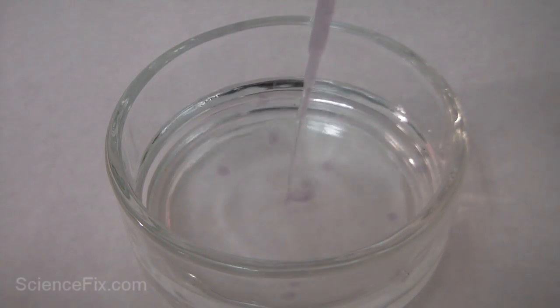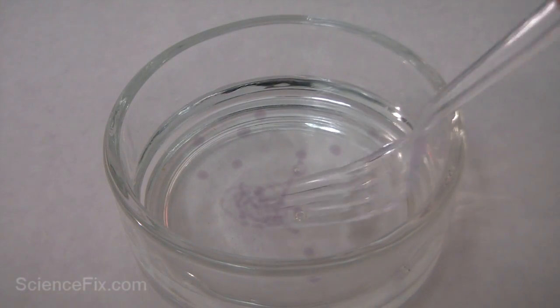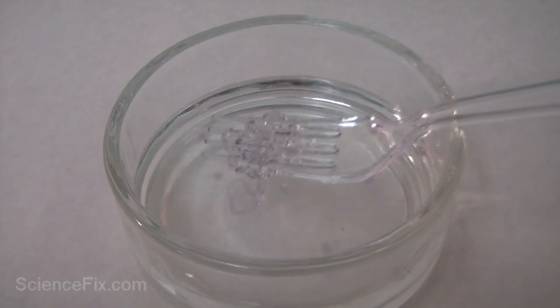Next, a larger amount of sodium alginate is squirted at once into the calcium chloride, and you can see it created almost like a worm-like structure.